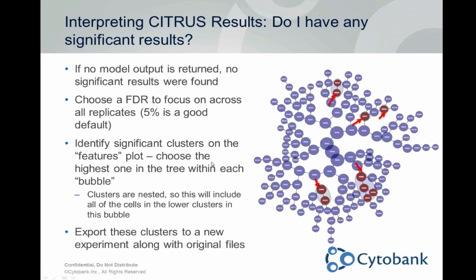However, if you're doing this kind of workflow to map back to ViSNE, you should choose the highest bubble in that tree, or the one closest to the trunk, if we're extending this analogy further.